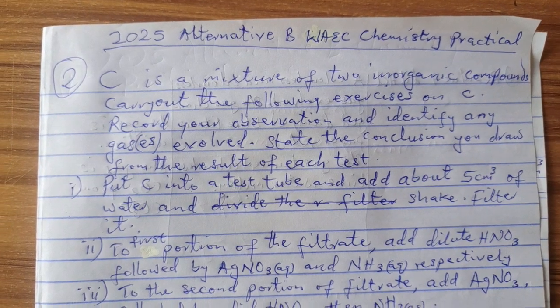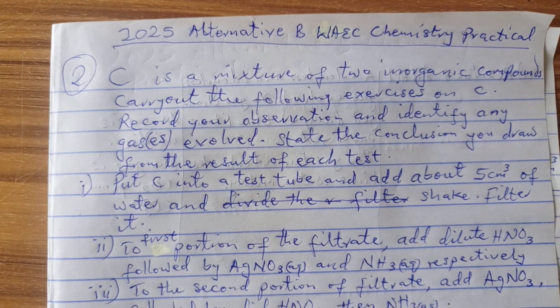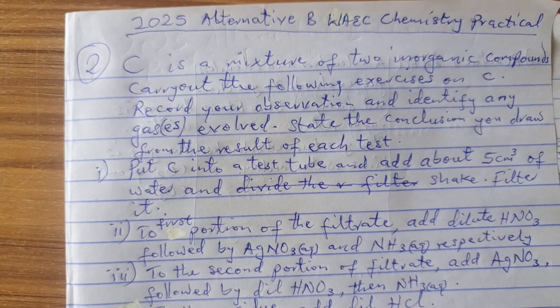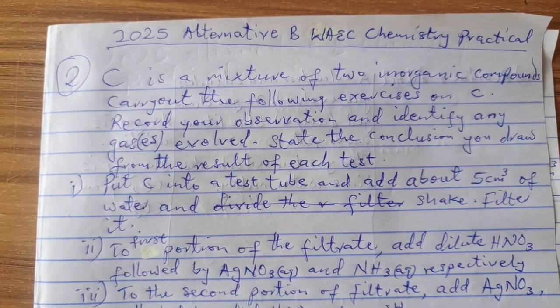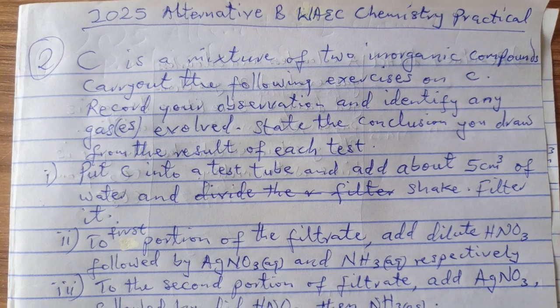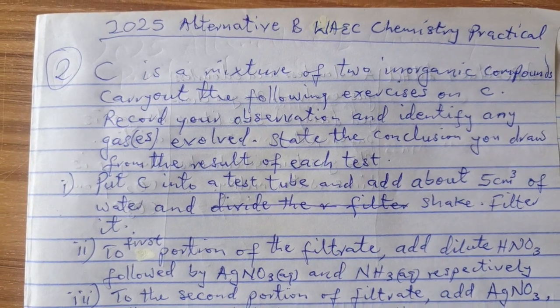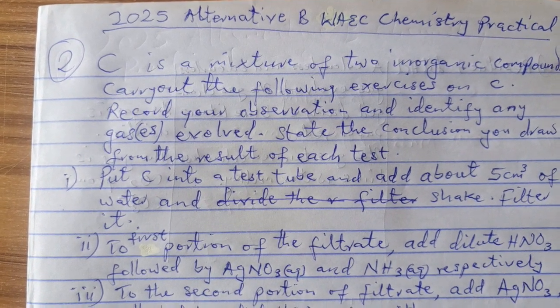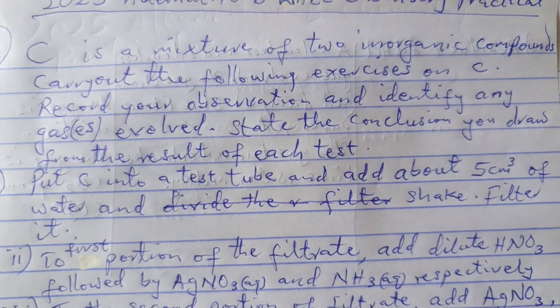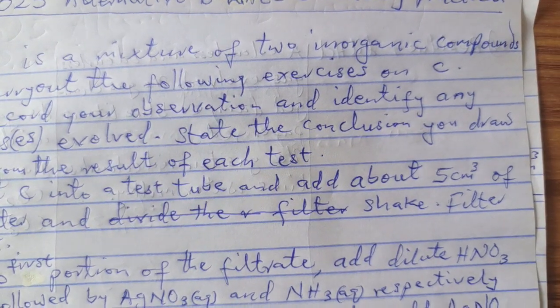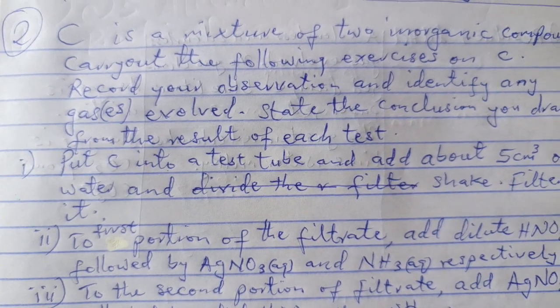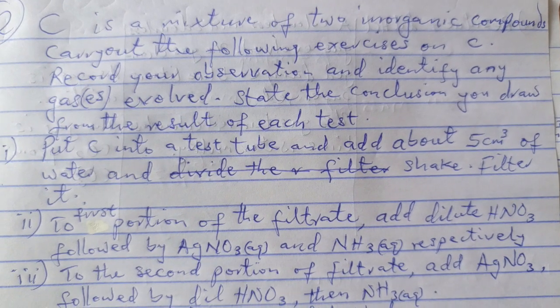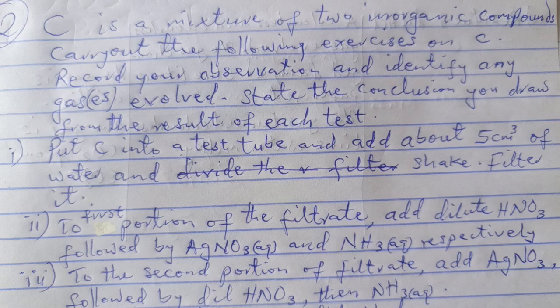The question 2 of this year is expected to be of mixed substances. So now the question goes this way: C is a mixture of two inorganic compounds. Carry out the following exercises on C. Record your observation and identify any gas or gases evolved. State the conclusion you draw from the result of each test.